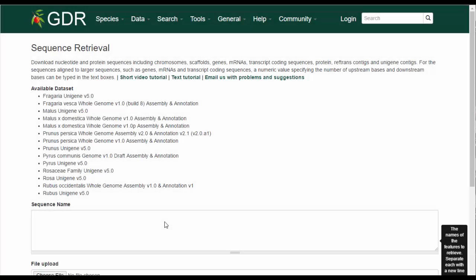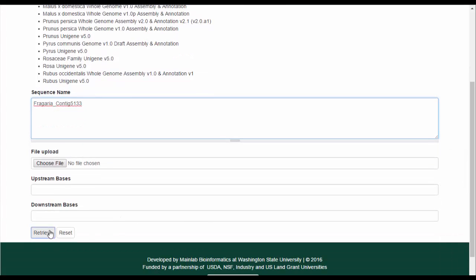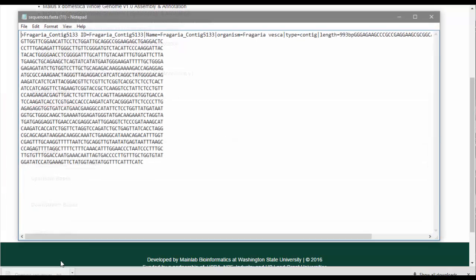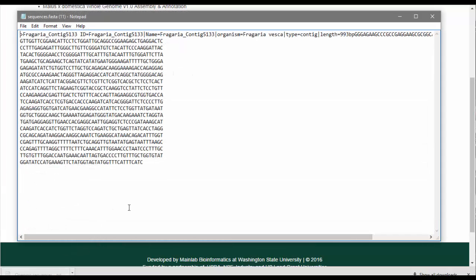As another example, let's retrieve a specific contig from a unigene assembly. We simply enter the contig name and click Retrieve. Again, a text file is generated with the sequence in the FASTA format.